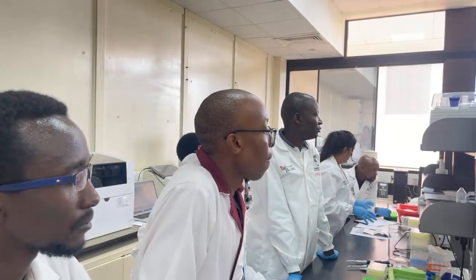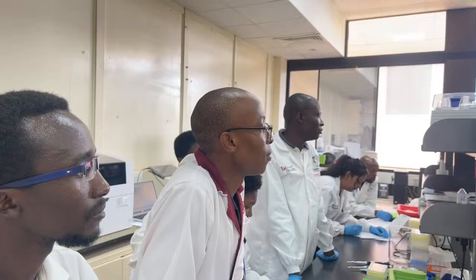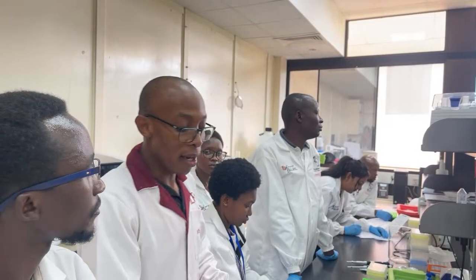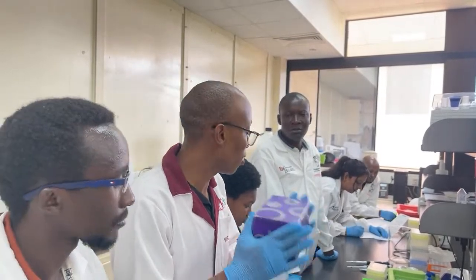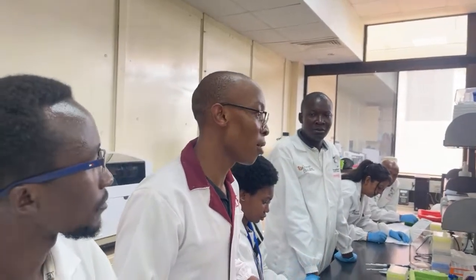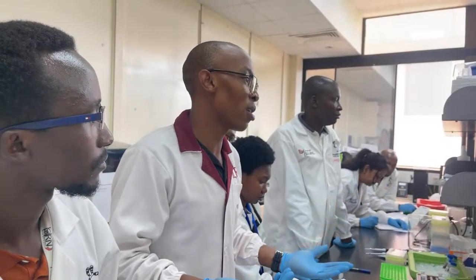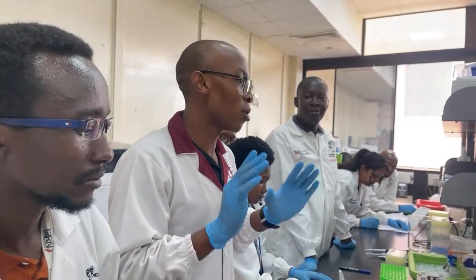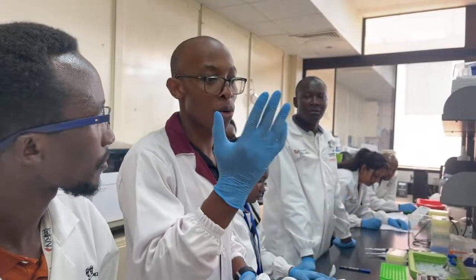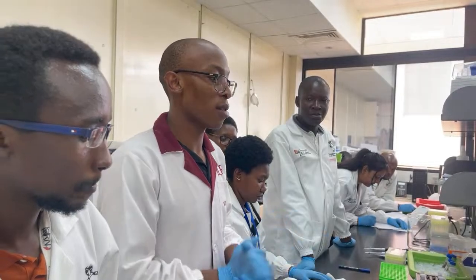Question. Does that mean if I'm working with bacteria or fungi, I can use the other kits? Yeah. There are high molecular weight extraction kits for bacteria, but it's not necessary. The organism is so small that you don't really need 20 kb long fragments. You understand what I'm saying? So you can use your Zymo kit, you can use your Monarch kit like the one we're using, you can use your other kits for those kinds of things.